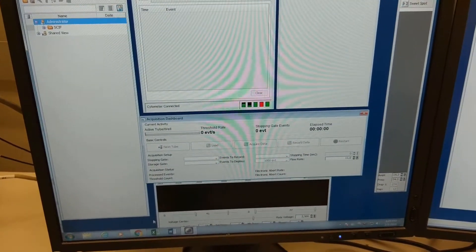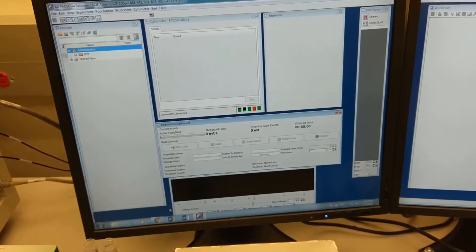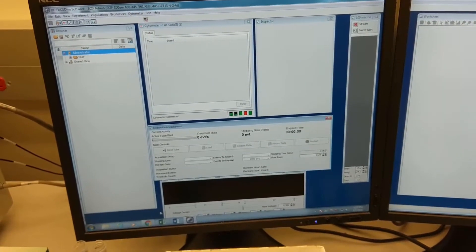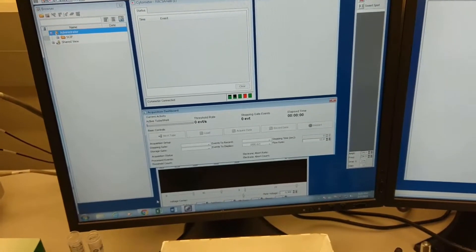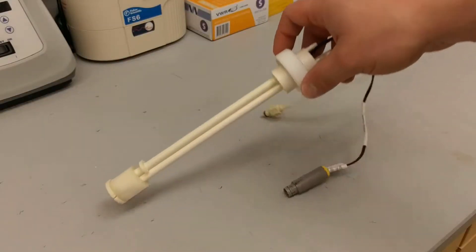This has happened several times to me over the past couple years, and what I've found is that the sensor frequently can go out on these things. So let's take a look at one of these sensors.